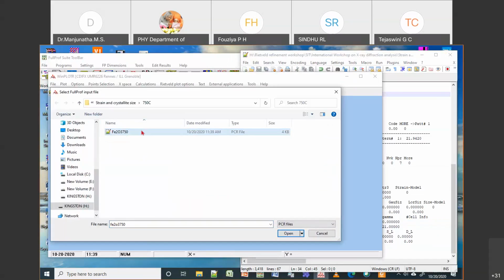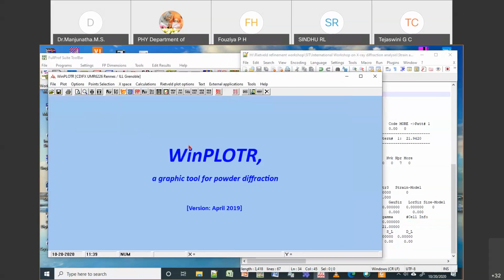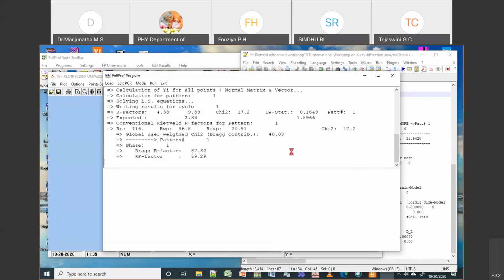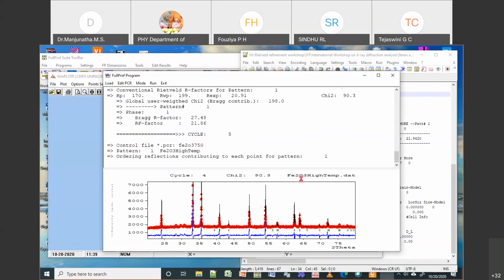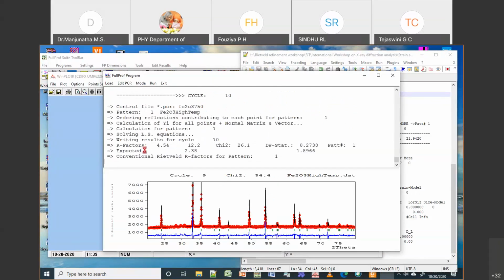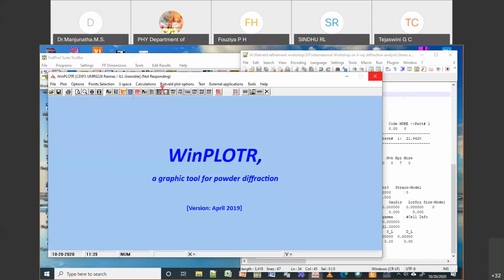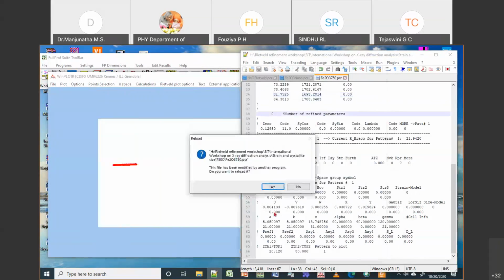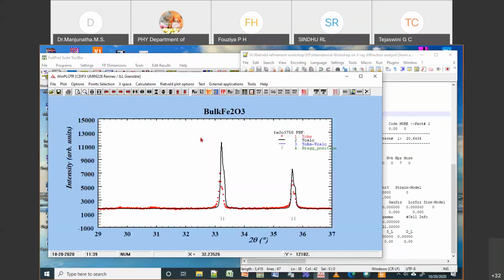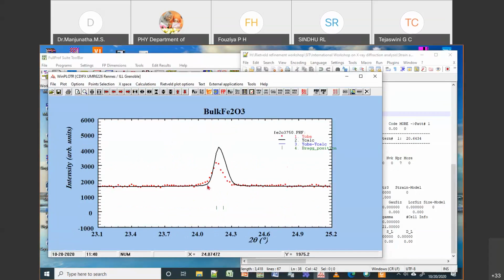So what I'm doing is I'm just trying to do it manually. Okay, so let me see. Now it should work. Okay, so you can see already it is shifting a little bit, and then yes, now it's working. Okay, so you can see it came to 26. Before it was higher. So now what I will do is I will run one more time, so you just try to come back to original position very quickly. Okay, so it is almost good.